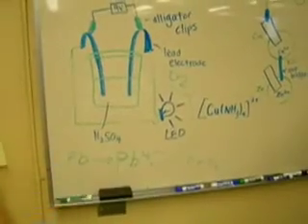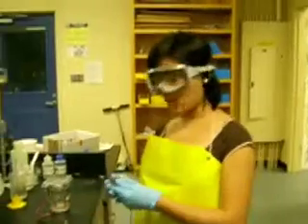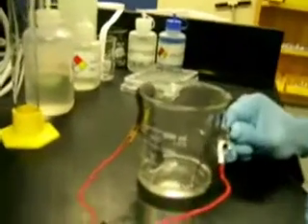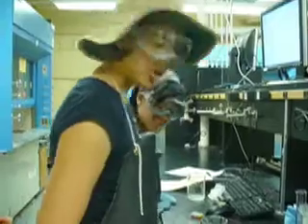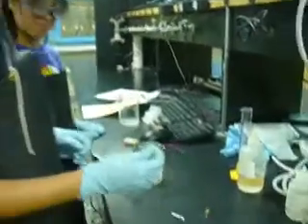And now, let's test if our actual battery works. After charging for about a minute, we can connect the voltmeter to the 2 electrodes to see if the battery actually works. And yes, look, it does work. We have potential. Now that our battery is fully charged, we can go ahead and attach our LED light.